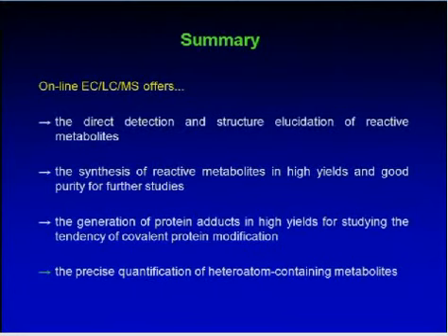Yeah, true. But actually, of course, you cannot compare this in all cases. That's what I said in the very beginning. You have surprisingly high correlation between the two approaches. And what should also be pointed out, in some cases, people are assuming that the liver cell microsomes are somehow the truth. This is not fully correct, because in many cases you will not see the reactive metabolites, because in the liver cell microsomes the reactive metabolites will bind to the proteins in there, so you'll not see them unless you add trapping agents. So that's one of the reasons also which are advantages for electrochemistry compared with liver cell microsomes, and which also of course leads to deviations between these two.